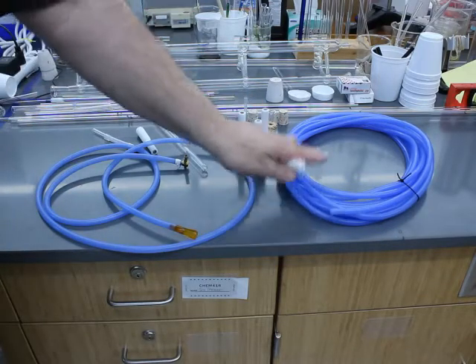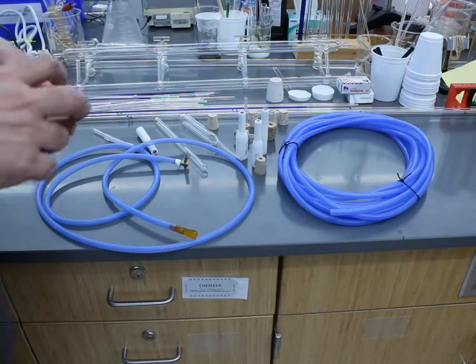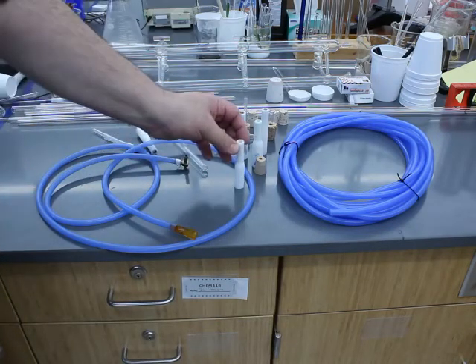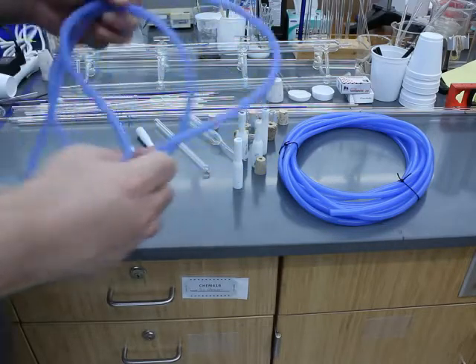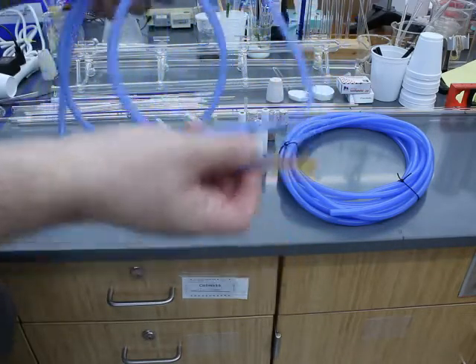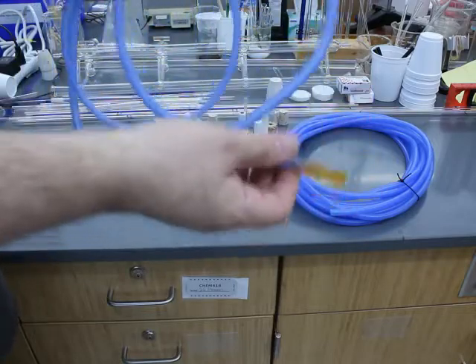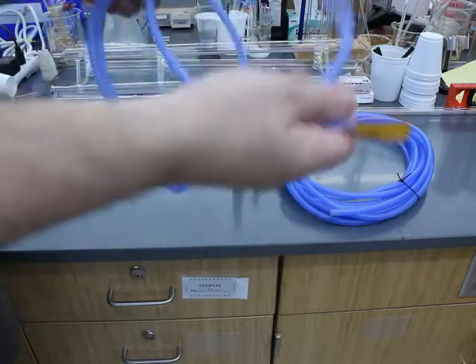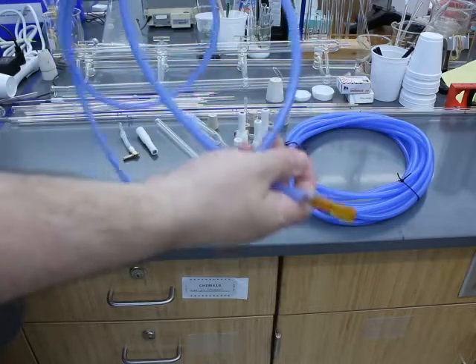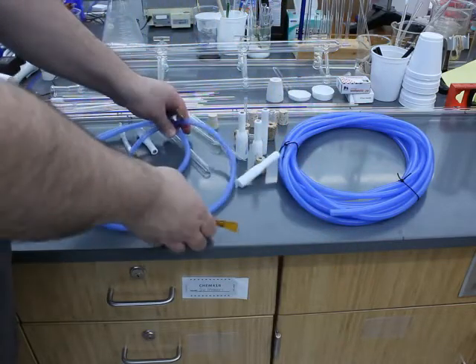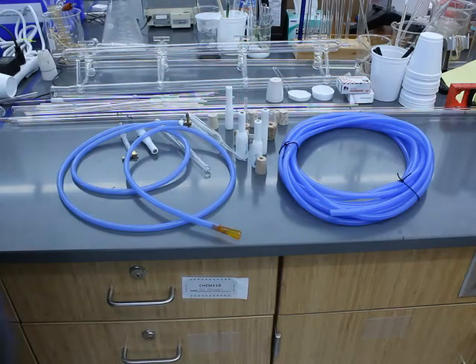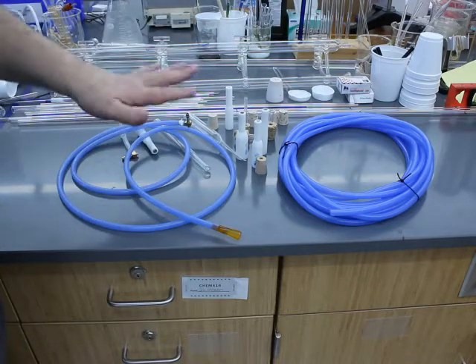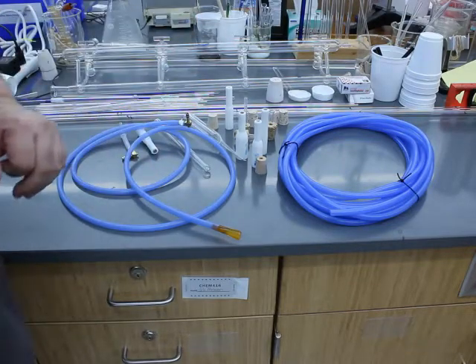The hosing I bought from McMaster, but you can source this from anywhere on the Internet. A length of tubing, and I'm about six foot, and my blow hose is about, I think, six-six. So you kind of have to cut the length of the hosing to whatever works best for you. It's actually probably a little bit long, but in some cases you do need a little bit more flexibility as far as how you position the glass.